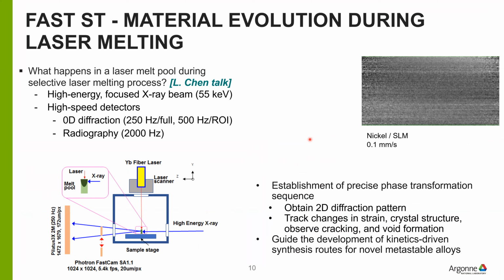Now, one offshoot of this type of 0D measurement, a single point measurement, would be doing these measurements really fast. I will highlight that this is something Andrew Chuang in our group has been leading quite a bit, combining, for example, dynamic processes like additive manufacturing and deploying a very fast, very high frame rate diffraction detector and also an imaging detector to image, in both diffraction and radiography, how the powder bed changes and how solidification happens.